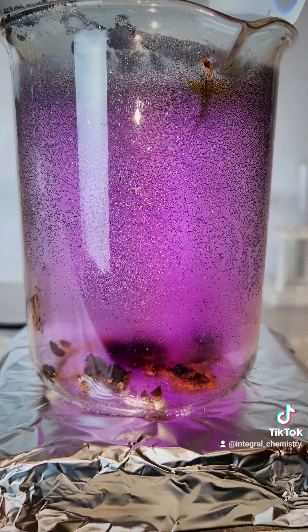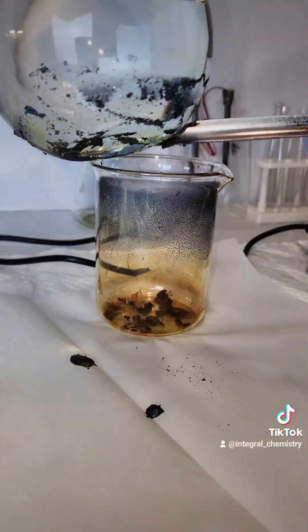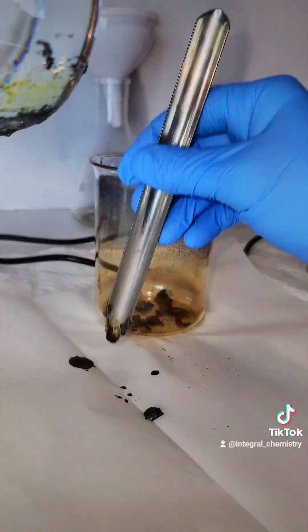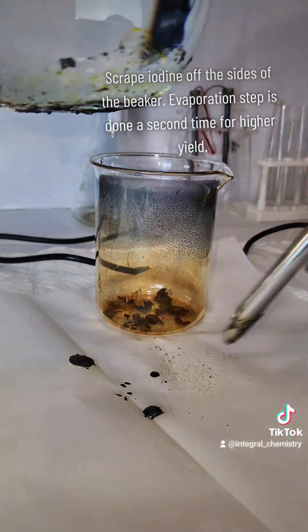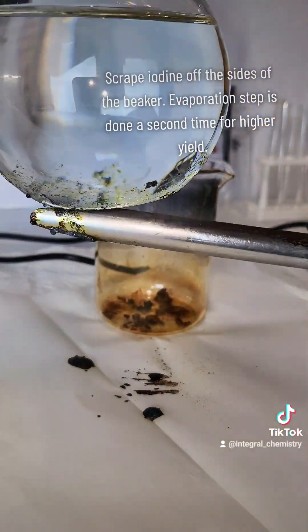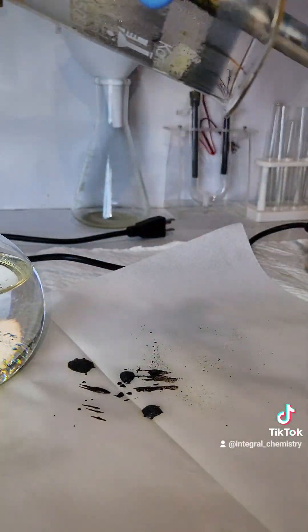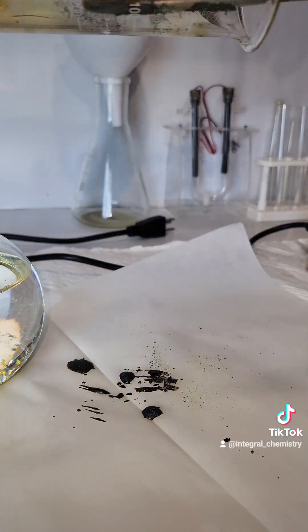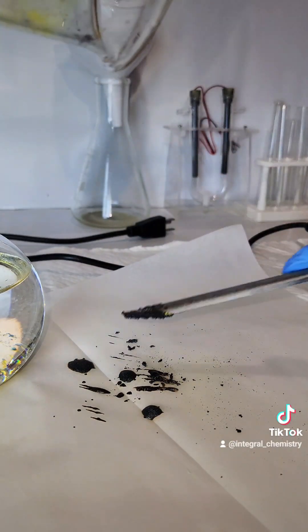Once the sides of my beaker are pretty thoroughly covered in iodine crystals, I cut the heat, remove the beaker, and allow it to cool until no more iodine gas is visible. At this point, I use a spatula to scrape all of the crystals off of the bottom of the flask that I placed on top of the beaker, as well as the sides of the flask itself. I don't want to scrape any of the crystals off of the bottom, as those are still pretty contaminated with povidone.